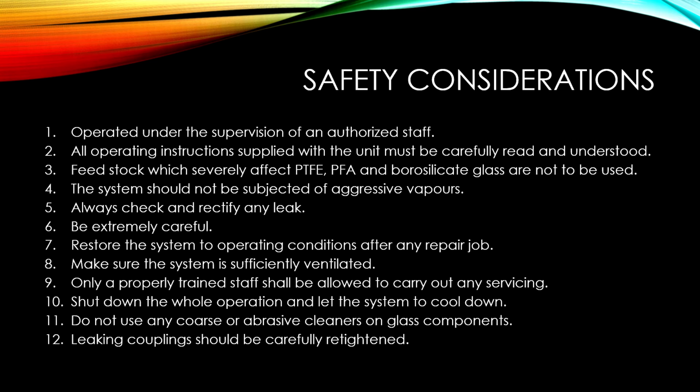Make sure the system is sufficiently ventilated when working at atmospheric pressure. Only properly trained staff shall be allowed to carry out any servicing. The manufacturer's manual must always be observed.